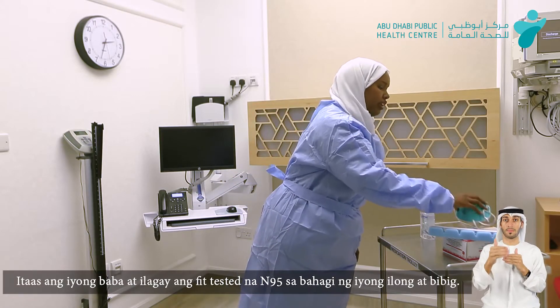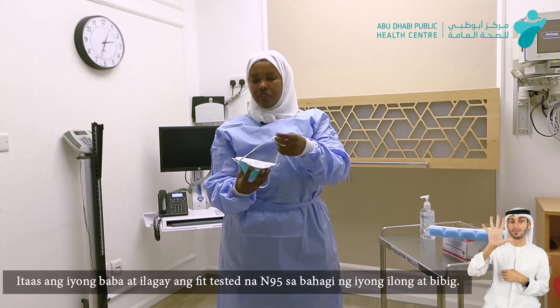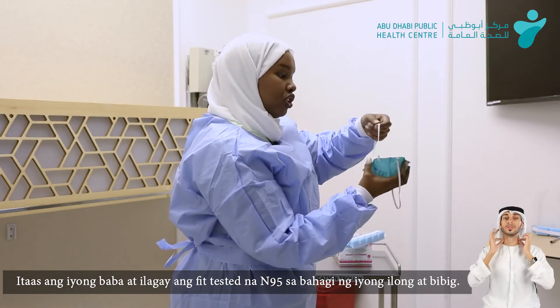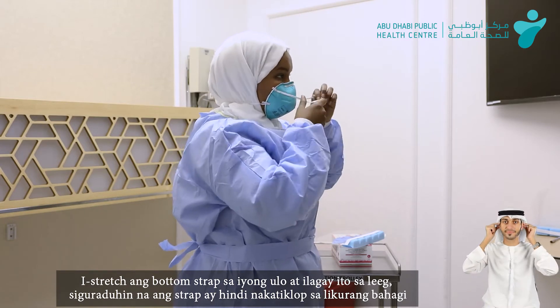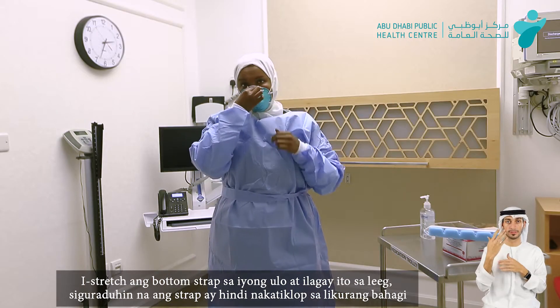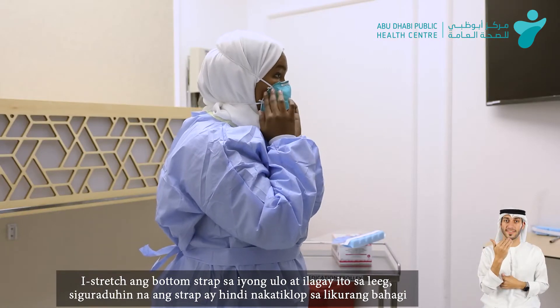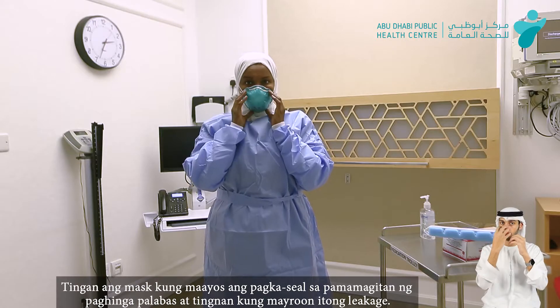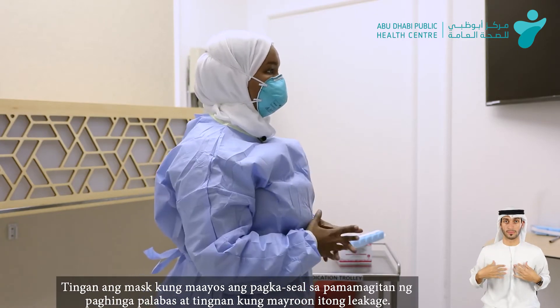The next step is going to be using the N95. I have to wear the N95 — it has two straps. We'll start from the bottom strap, stretching it to the neck, and the second one to the back crown of the head. Make sure the fit is proper. Secure it by using the index finger around, making sure that it has a good seal. Try to see if there is any leakage — no air — it means that it's properly secured.